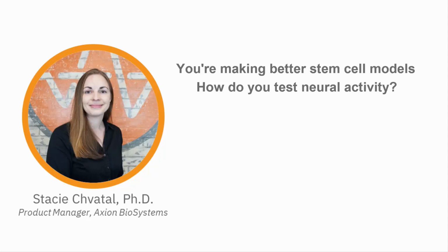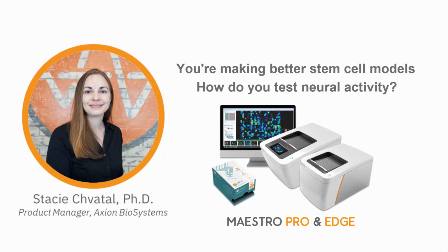Today I will give a brief introduction to Maestro MEA technology, and then you will hear from two speakers using stem cells and Maestro MEA to study mechanisms behind epilepsy and neuropathy.